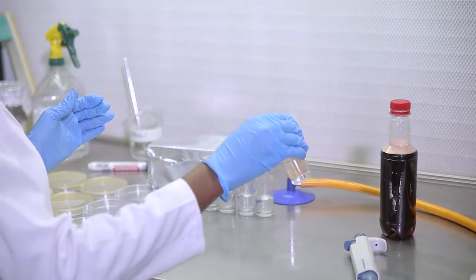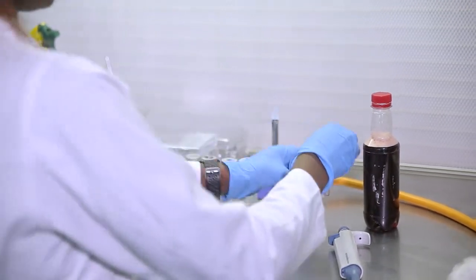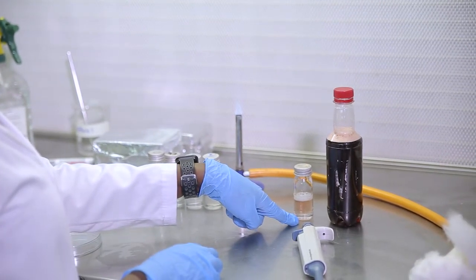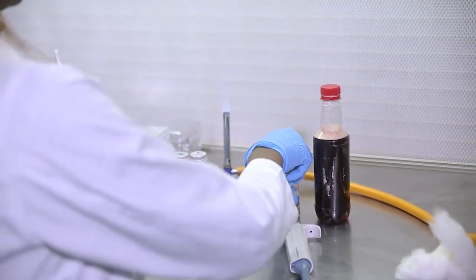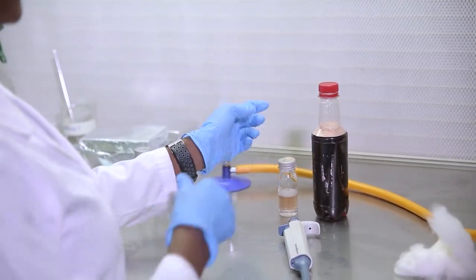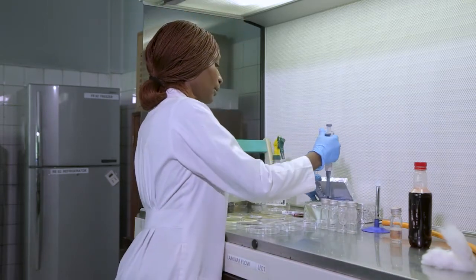If you have a vortex, you could vortex for about 5 to 10 seconds. So this is going to be my 1 out of 10 or the 10 to the power -1 dilution. So this original sample has been diluted 10 times. Okay? So from here, I'll make my second dilution.